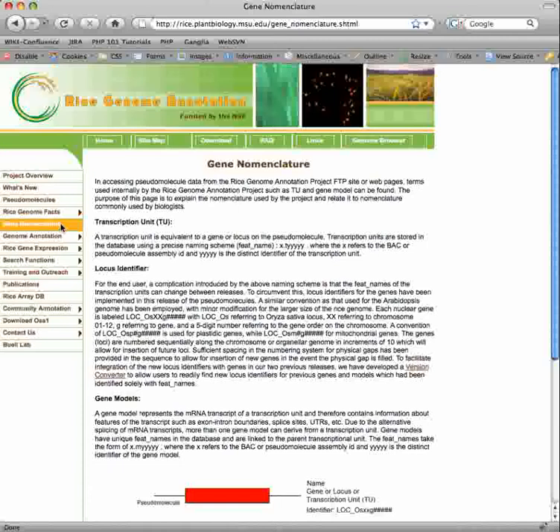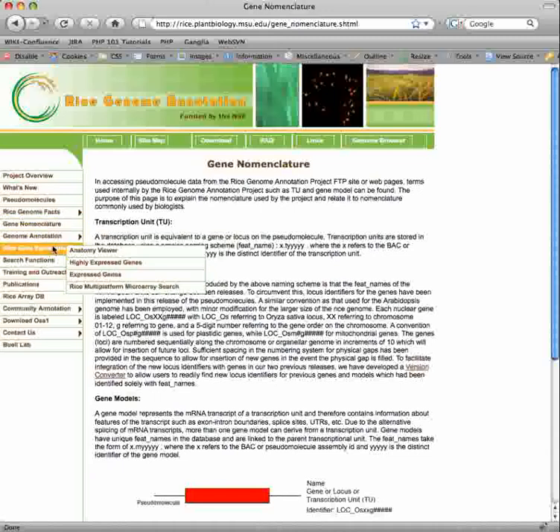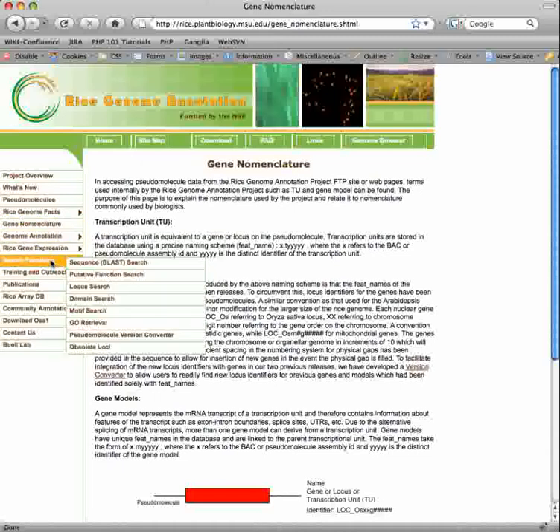How we name loci, genes, and gene models is described in the gene nomenclature page. The genome annotation, rice gene expression, and search function pages will all be discussed in further detail in separate tutorials.